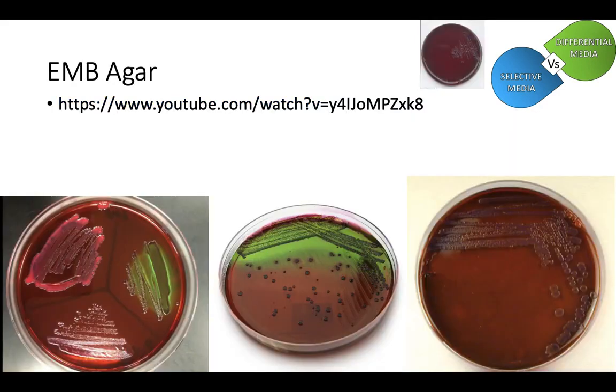Our next one is going to be EMB Agar. Now, EMB Agar, once again, is going to be a gram-negative type agar. It's going to be used for gram-negative species. You put a gram stain, you'll see it underneath the microscope. It comes back gram-negative, usually going to be your pink gram-negatives, and you're going to stick them on a MacConkey plate or an EMB plate, and this will help you figure out what you're looking at.